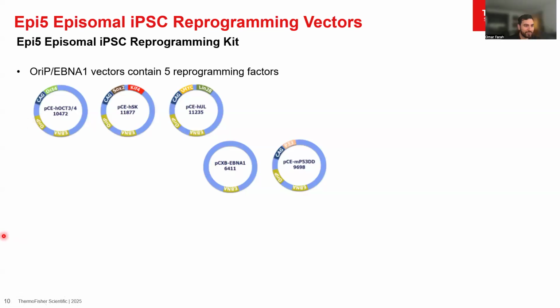Yes, and I see Angel said the same thing, right? PBMCs are resistant to mRNA-based reprogramming until you basically get those adherent cells that will be more easily transfected with mRNA-based methods. So we're going to do a slightly deeper dive into some of the reprogramming kits that are currently available.